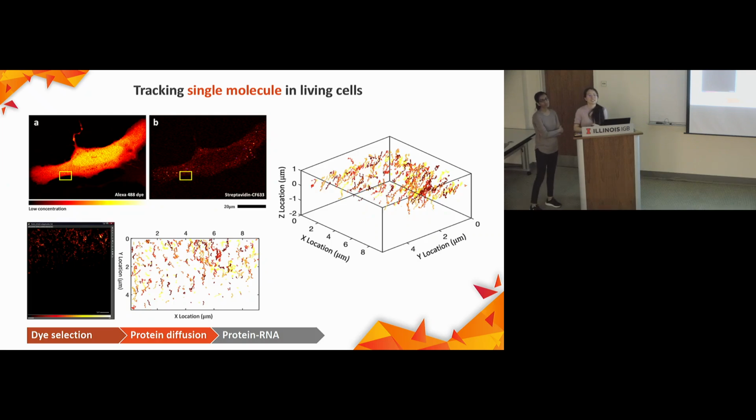Does it switch between molecules because it loses track of them, or is it programmed to watch for a certain amount of time and then look for something else? You just get to sample more molecules. There is a software that we use for the tracking. So if it's tracking, can it keep track of a molecule basically indefinitely? It will switch to other molecules after a while because the molecule is not stable all the time. So once it loses tracking, it will jump to another molecule and track.